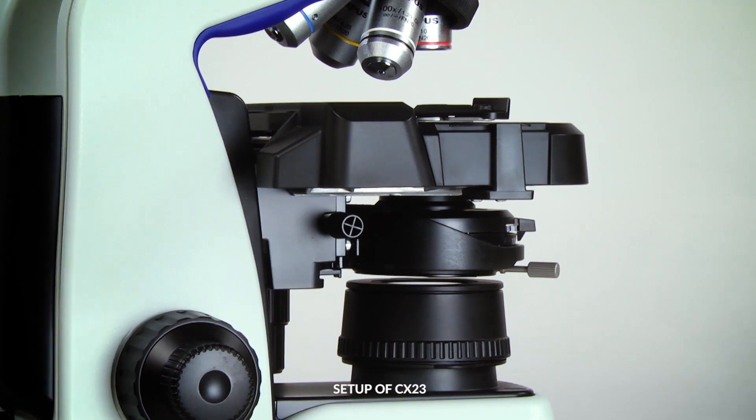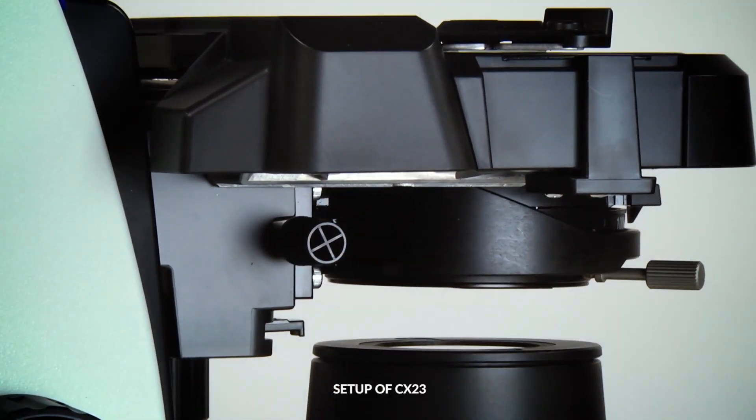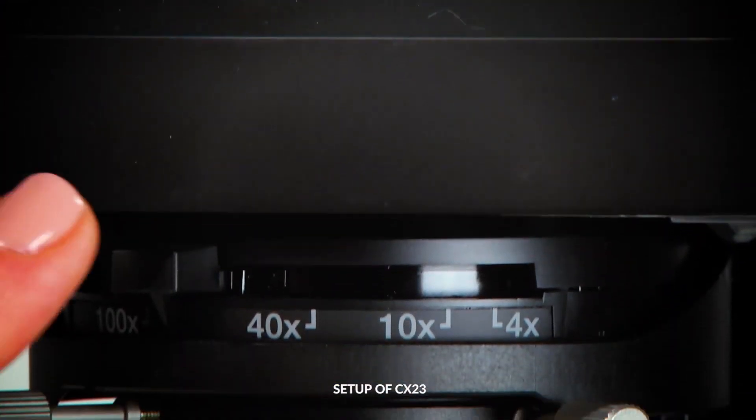Check to see if the condenser is in its highest position. If not, gently rotate the condenser knob until it is raised up as high as it will go. Lastly, adjust the aperture diaphragm so it matches the magnification of the objective being used.